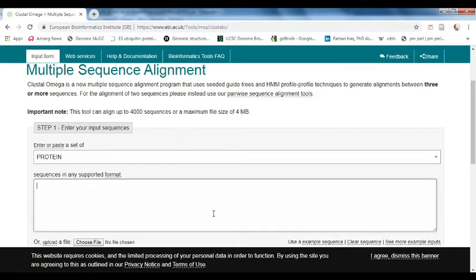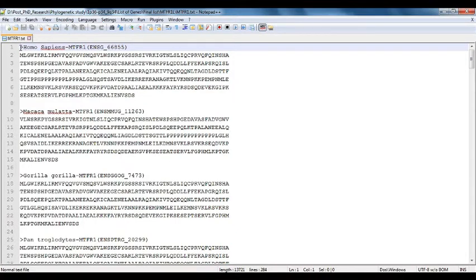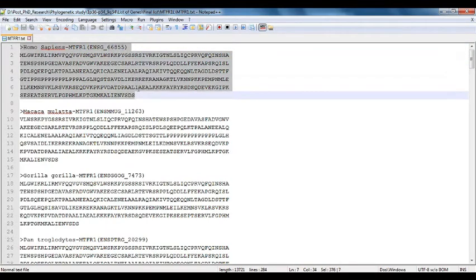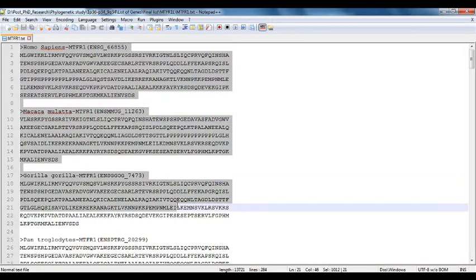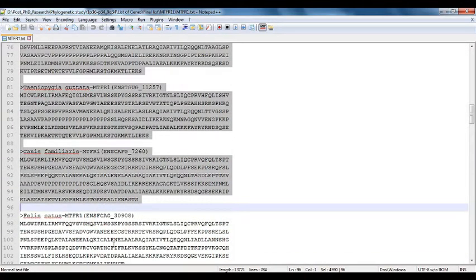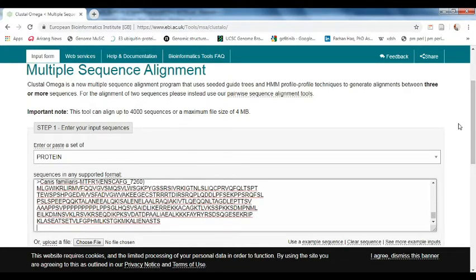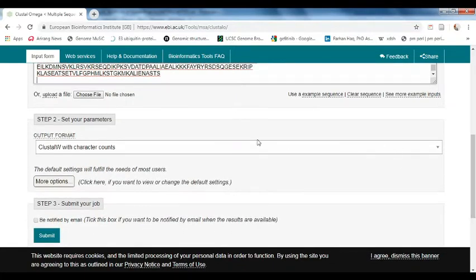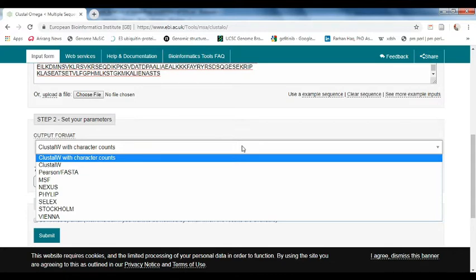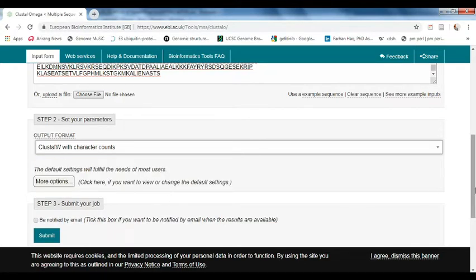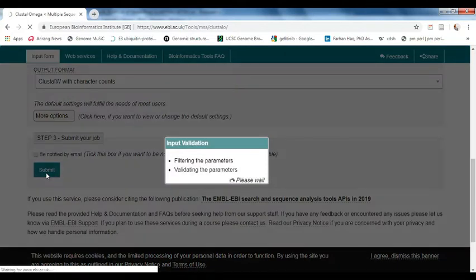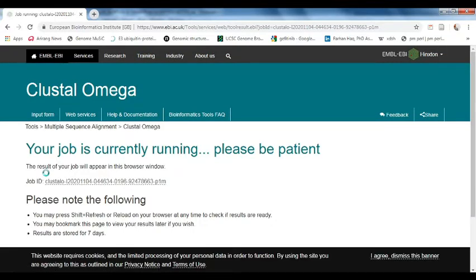We will submit some sequences — not four thousand, but a few. Keep in mind that all sequences should be in FASTA format: that is the greater-than sign, then the description of the sequence, followed by the protein or nucleotide sequence. I'll select sequences from one family — the MTFR1 gene — copy them and paste them here. We'll keep the output in ClustalW format, which is one of several options, then click Submit.